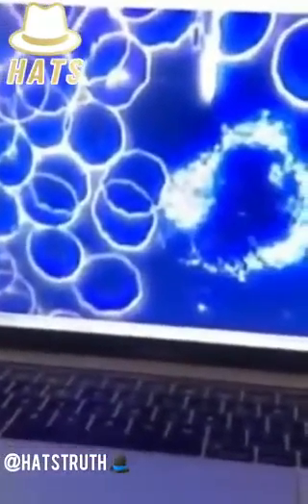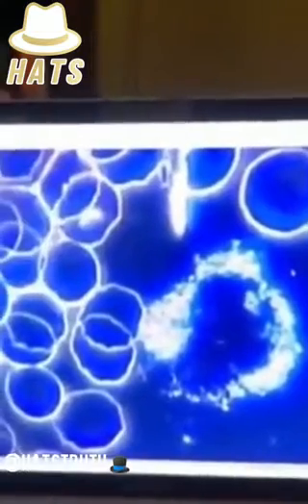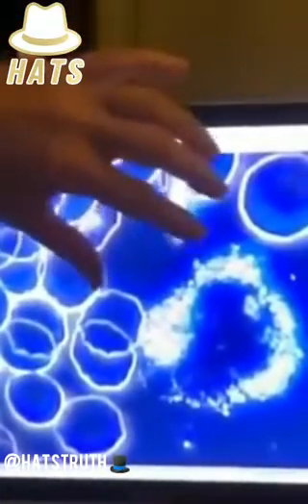Yes, definitely nothing organic. I took it because you can actually see the cell surfaces here are really not healthy. So the cell membranes are not healthy. That's usually happening with some intoxication or something happening. And this is actually a white blood cell which is completely destroyed, which I have only seen in people after receiving chemotherapy or some kind of similar treatments that are very toxic.